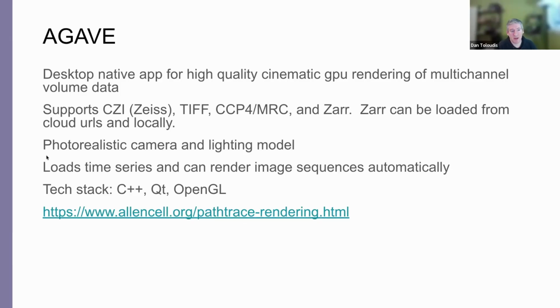So Agave features a photorealistic camera and lighting model for visualizing the data. It can load time series, and it has a mode where you can render out image sequences from your time series automatically. Built with C++, uses Qt for the user interface and OpenGL for graphics.